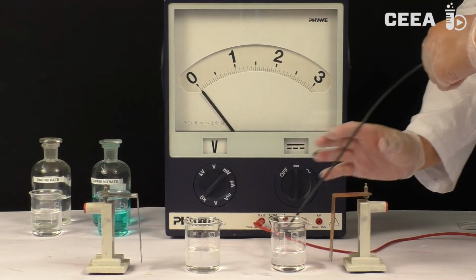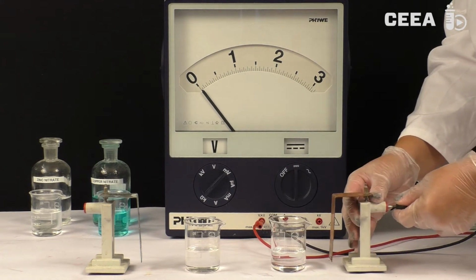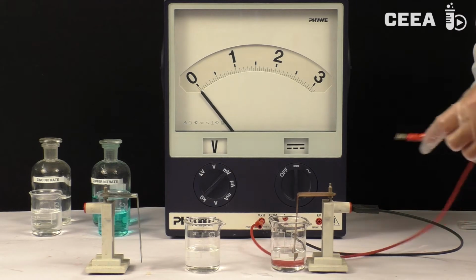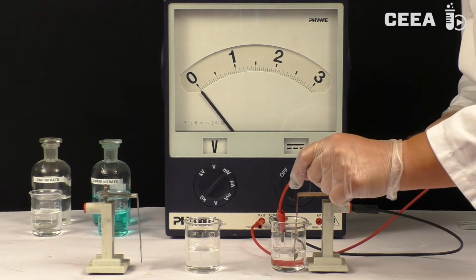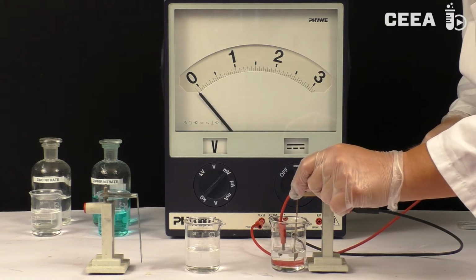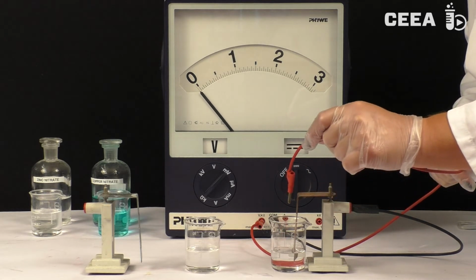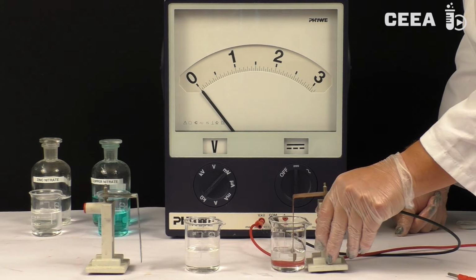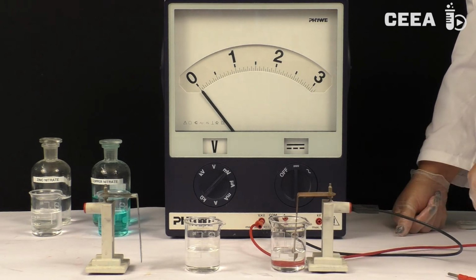We then repeat this procedure with a copper plate. We barely see any potential difference. It is not very surprising because we know copper to be more noble than zinc. Could copper prefer to be metallic rather than being dissolved?